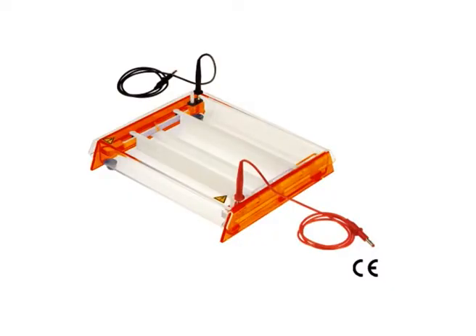Common mediums used in electrophoresis. Cellulose acetate. Cellulose acetate is a cellulosic derivative in which each hexose ring of the polysaccharide chain has two hydroxyl groups esterified to acetate, in general in the C3 and C6 positions. Cellulose acetate is quite prevalent in clinical chemistry as it offers a convenient support that can be equilibrated with buffer in a few seconds and yields good separations of proteins from biological fluids.